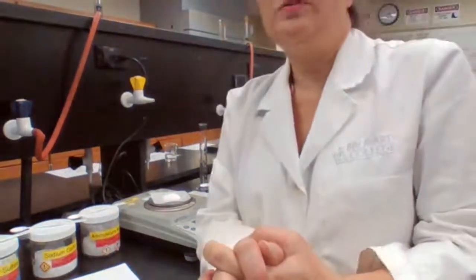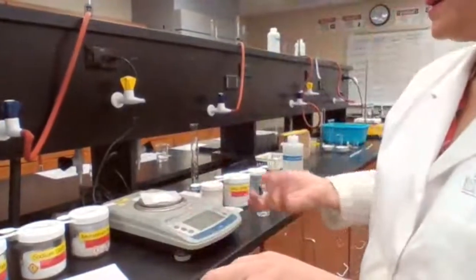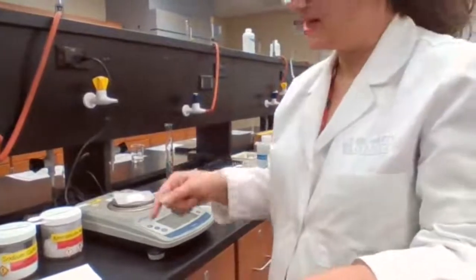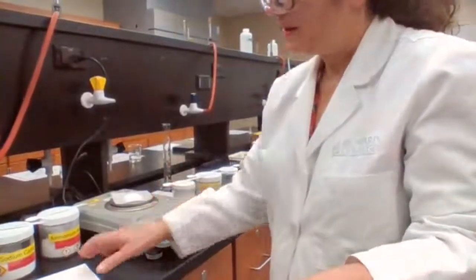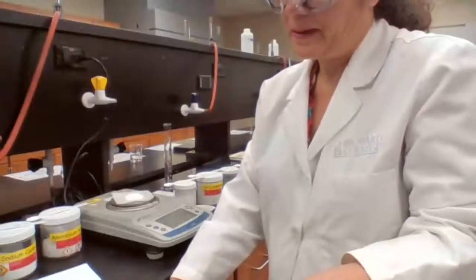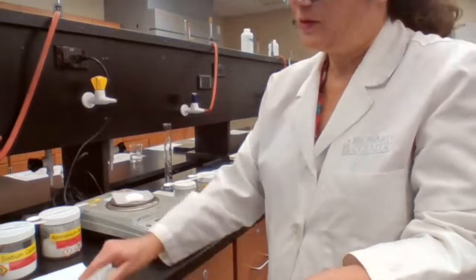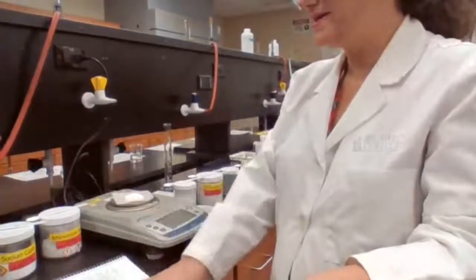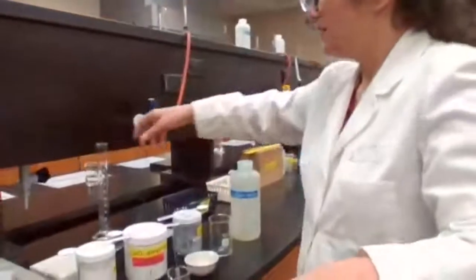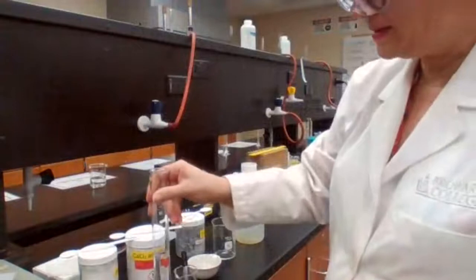Okay, if we have 2 more minutes before it gets to 15 minutes, I'm not going to measure it yet. I'm going to wait the 2 minutes because it's asking for 15 minutes. We can probably start with different part of the experiment. The second part of the experiment is measuring volume. For measuring volume, the devices that is used to measure volume, or we can at least talk about it, it's a graduate cylinder which comes in different sizes.